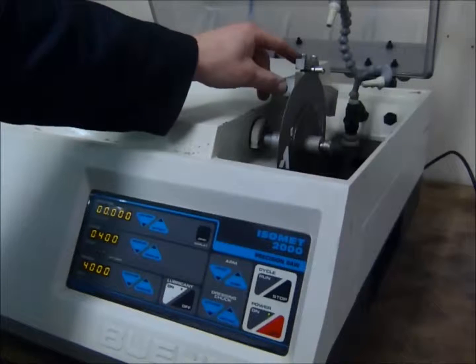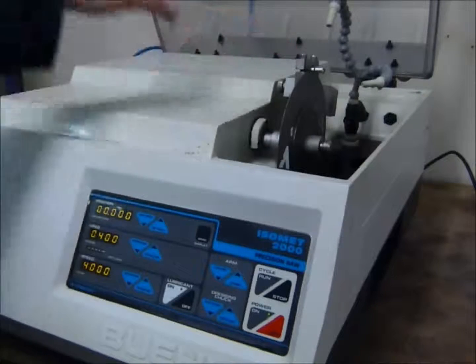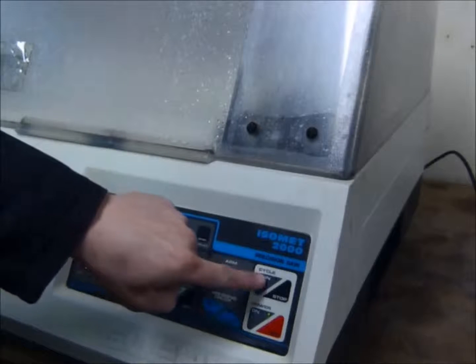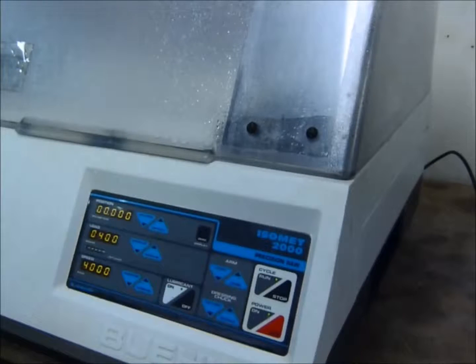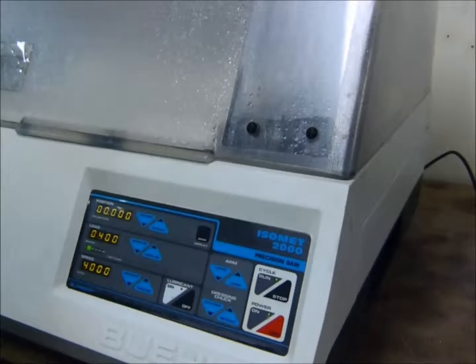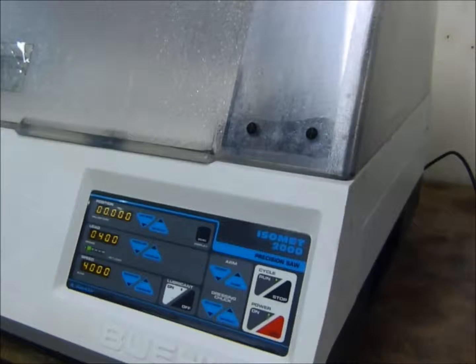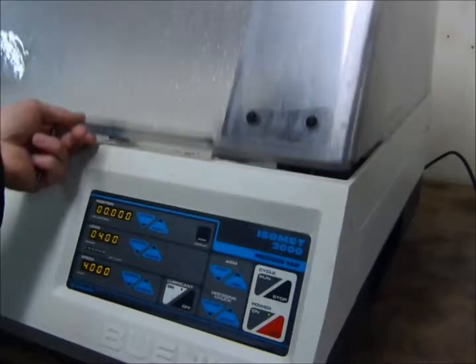Once you're happy with the position and where you want to cut, close down the lid and then press cycle to run — the machine will start. The machine will stop automatically once it's cut the sample.